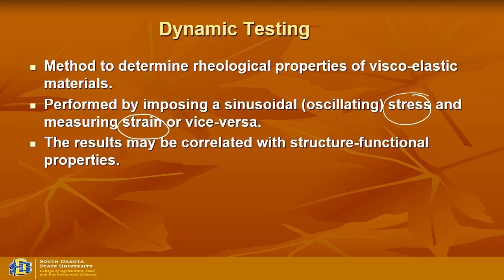When I say microscopic measurement, I don't mean to say go deeper, but it's a surface measurement. You are just applying the sinusoidal stress or strain on the surface of the material. So it's basically a surface property, not an internal property.